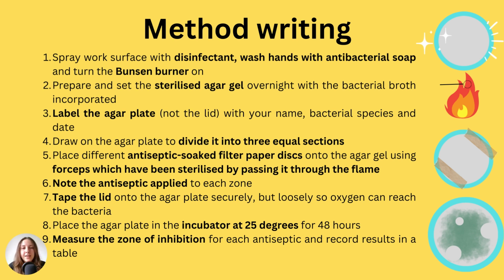So once you've done this, you can then incubate your gel at around 25 degrees or lower for around 48 hours. And it's really important that that gel, that agar, doesn't get a higher temperature than 25 degrees, because any higher than that, we're going into human body temperature of around 37, and that can encourage really harmful pathogens to grow, or microorganisms that cause disease, and we don't want that. So we only keep it at 25 or lower. Once that's done, you will actually have wonderful plates, hopefully, that show lots of results of zones of inhibition. We're going to talk about that now.